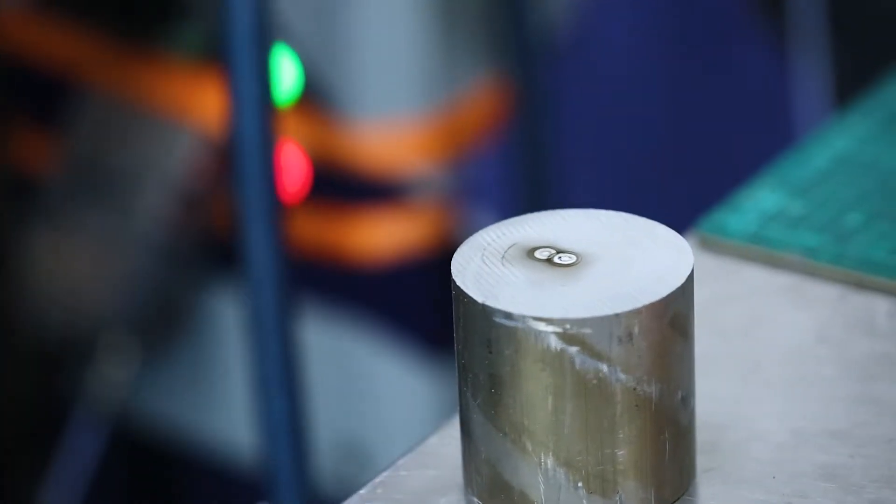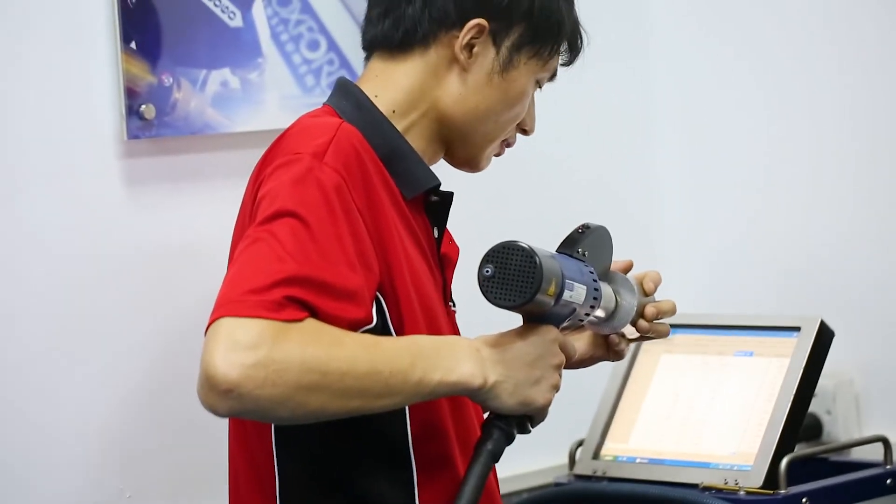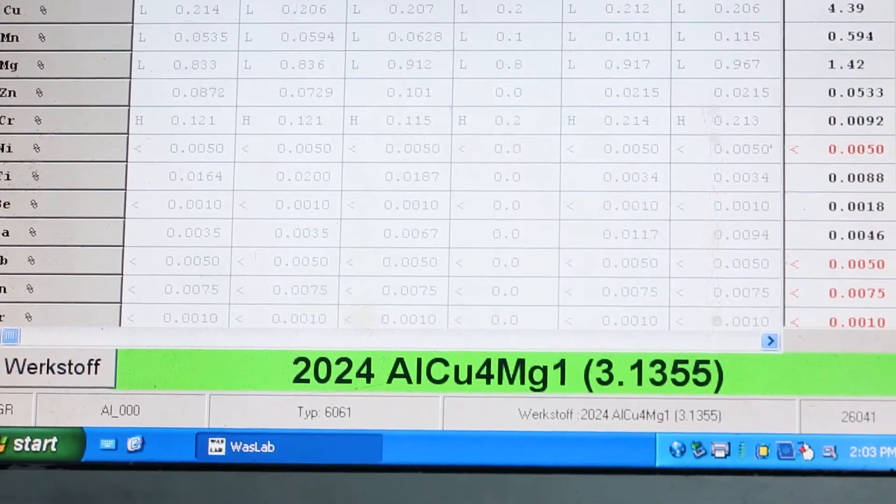That there is a spark site. Material is ejected at high energy, it decays, and the spectrometer can see from the decay what elements were in there.